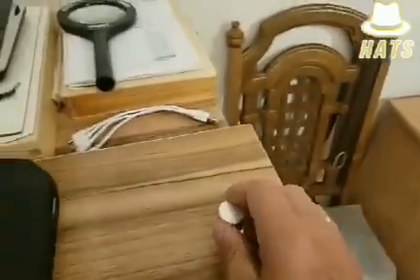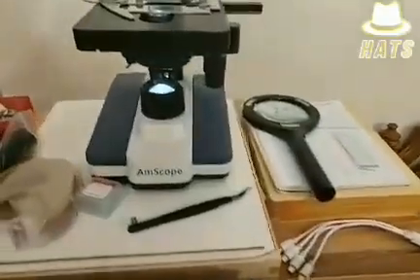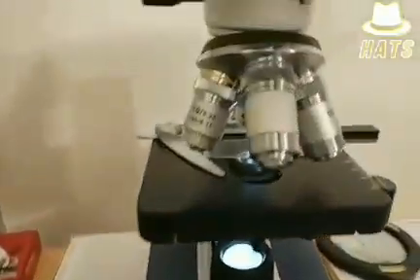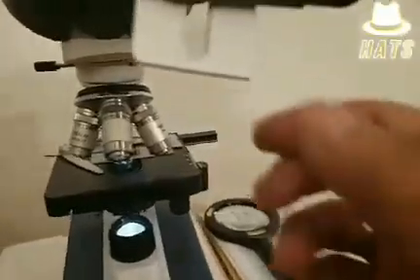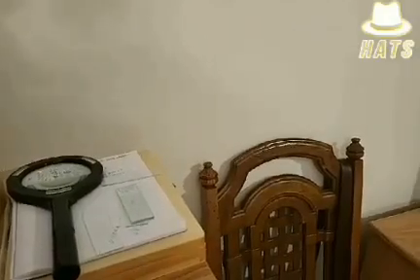I am looking now at what I found under the microscope. I wanted to see what they are putting in the hand gel because there is a lot of talk on the internet that they are putting graphene oxide in all the gels, and I will prove to you that's the case.